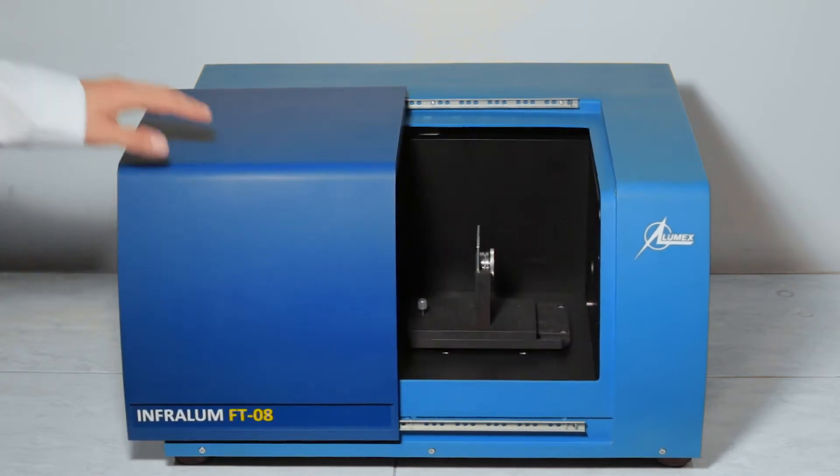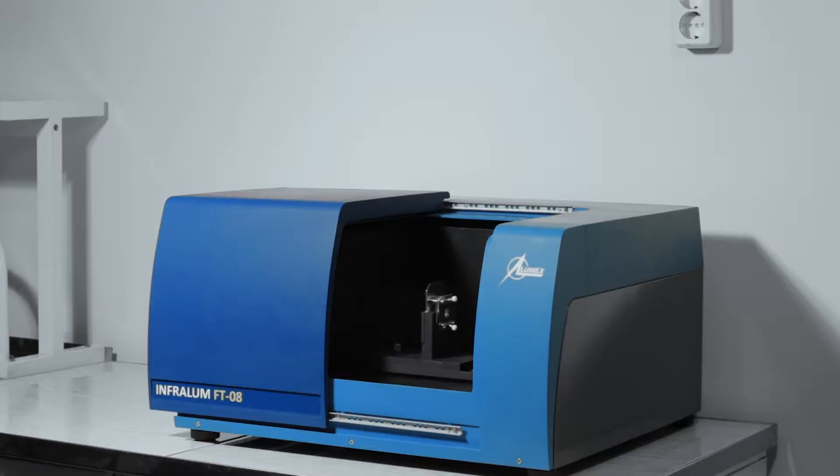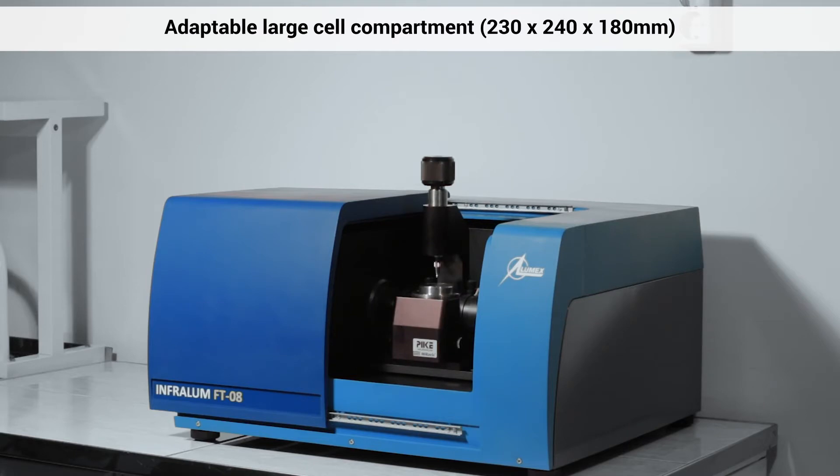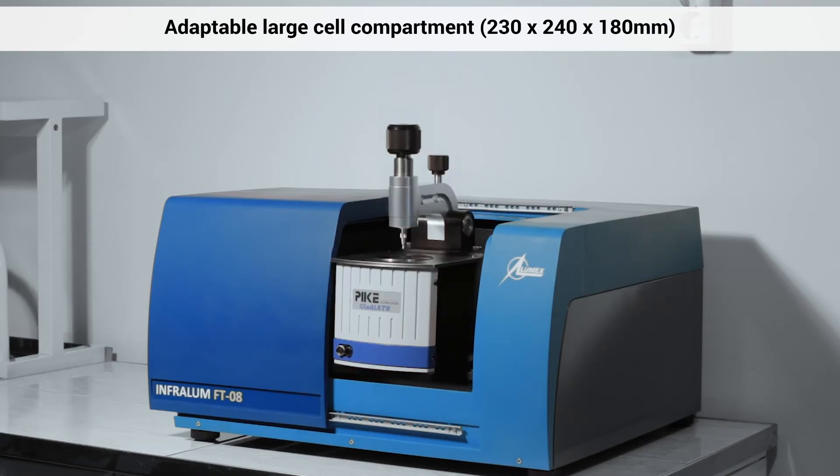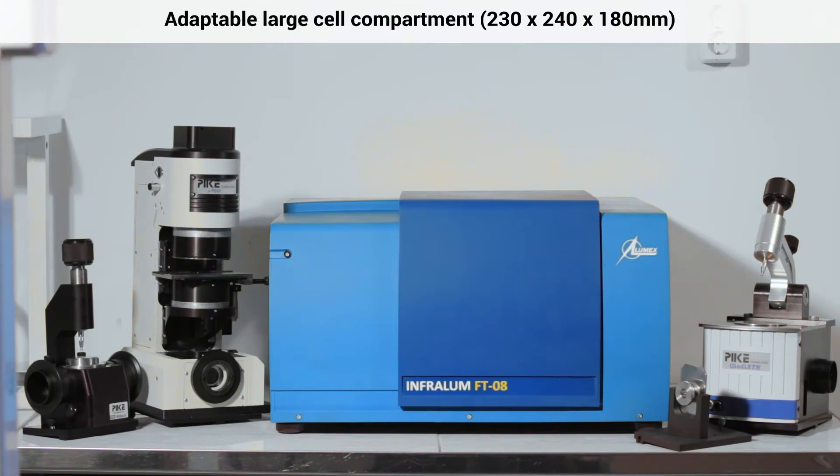Another advantage of FT08 is that it has a large cell compartment, which can accommodate a wide range of attachments and accessories from Pike Technologies and other manufacturers.